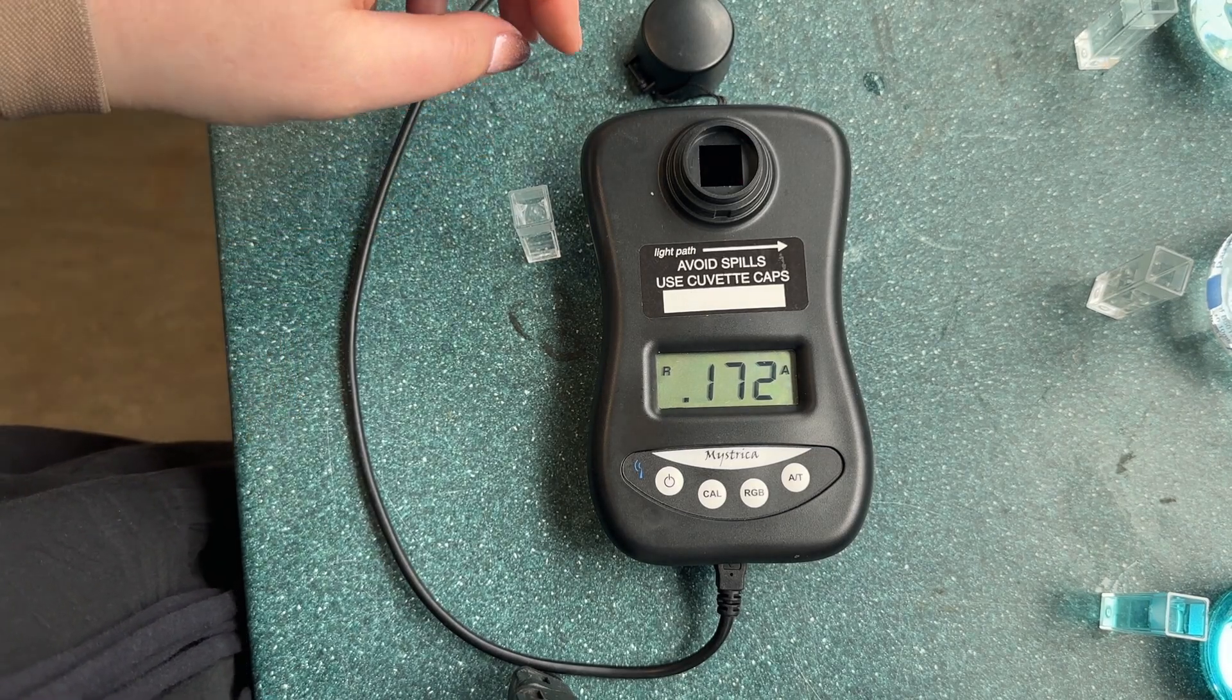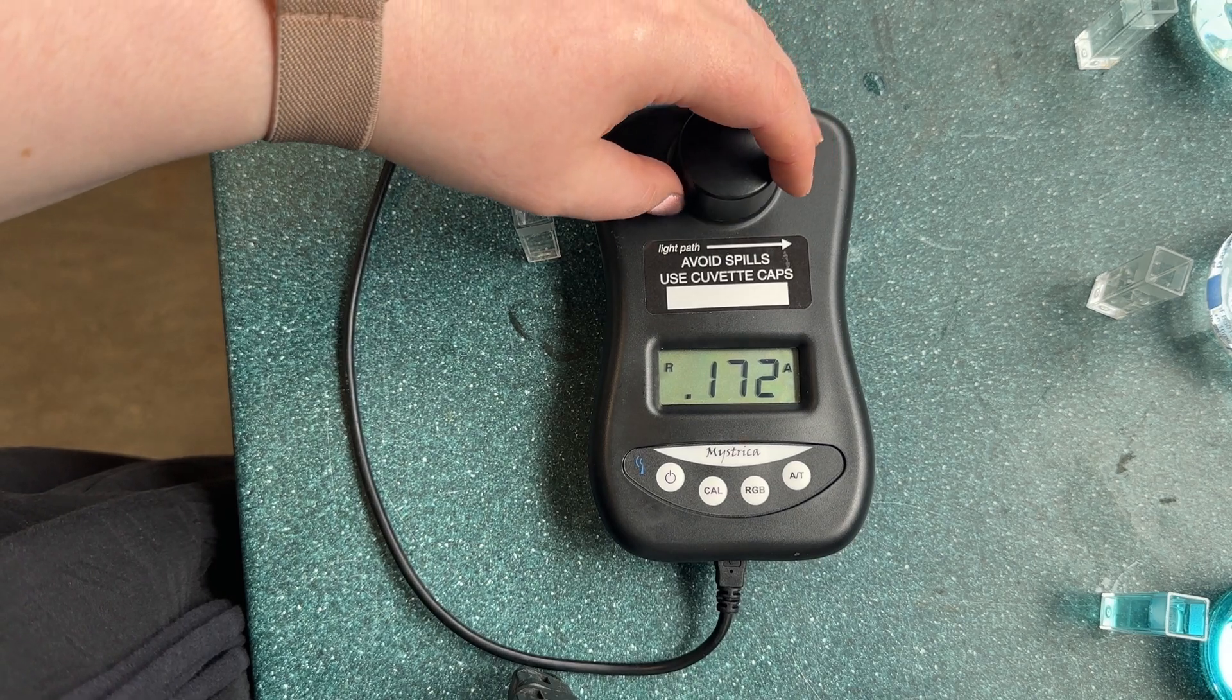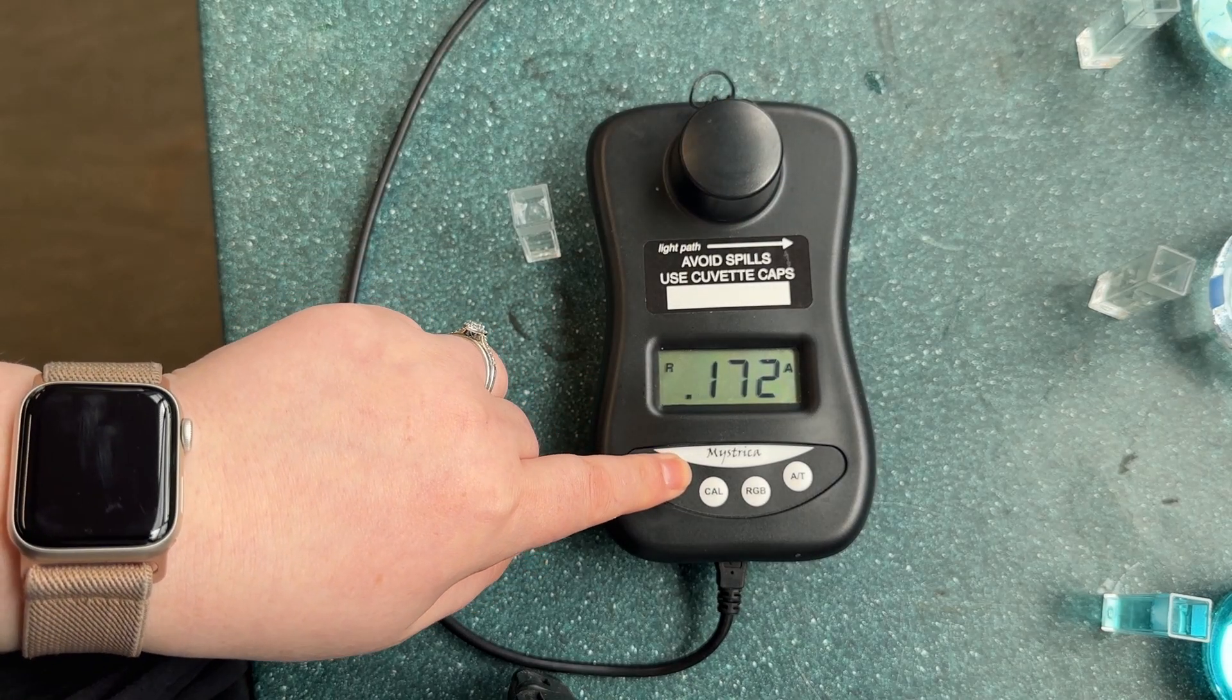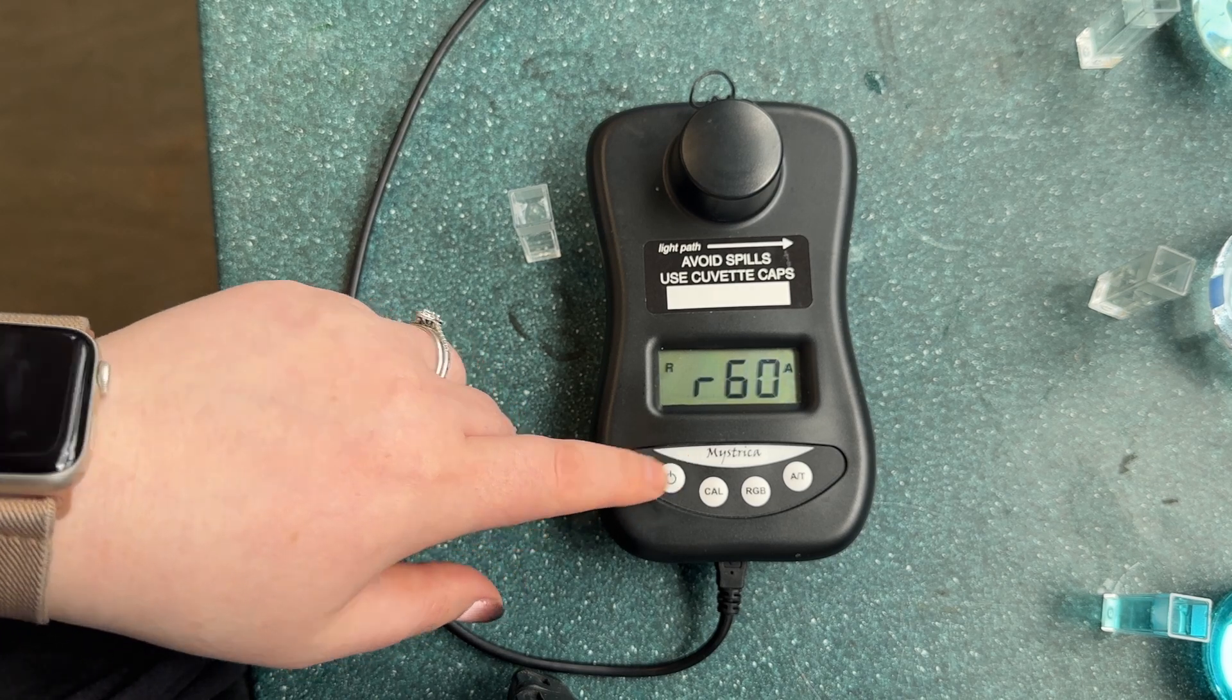To carry out the colorimetry itself we use a colorimeter. Here's an example of a very basic colorimeter. This colorimeter has three different color options: red, green and blue.